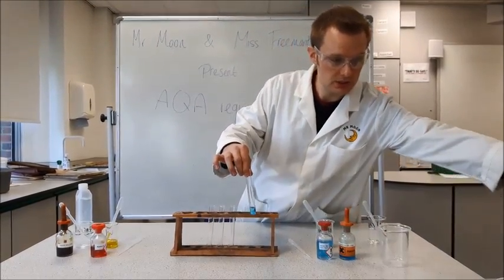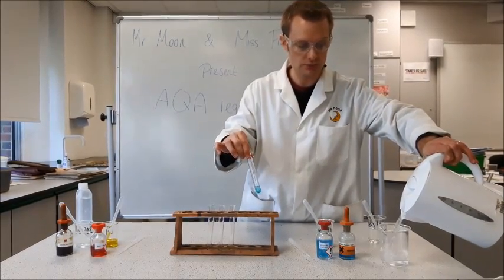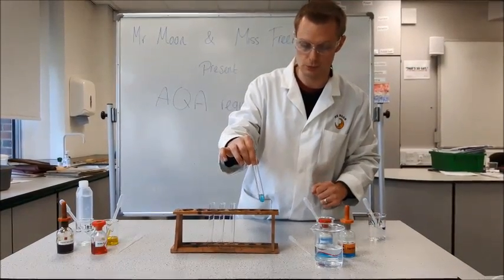What I'm going to do now is put it into a water bath and leave it just to the side of the camera, so you can hopefully during the rest of the video see the colour change to expect for a positive result for sugars.